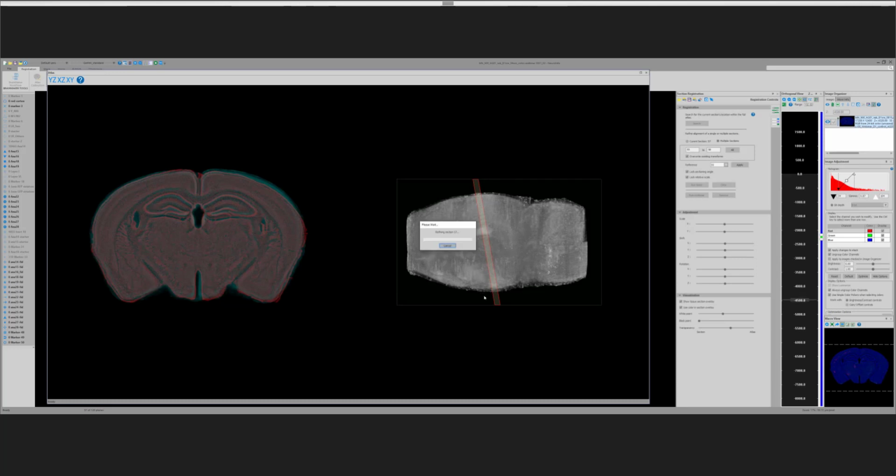You can see the angle, but the point to notice is that these parameters, the angle of the slice, is maintained for each of those sections. The major thing that it does is adjustments in the y-axis, because when we generate this whole brain volume, one of the things that's difficult is to get the sections aligned perfectly in the y-axis.